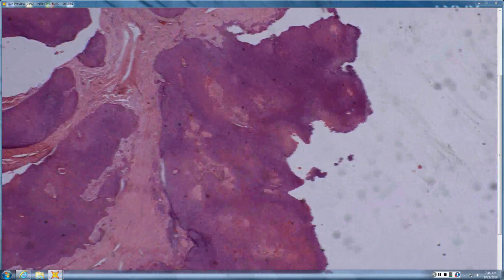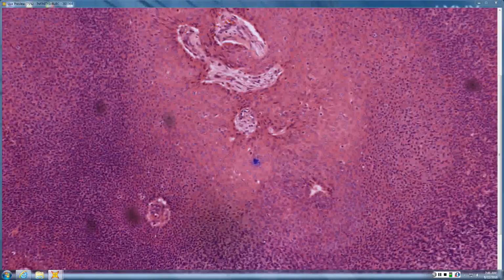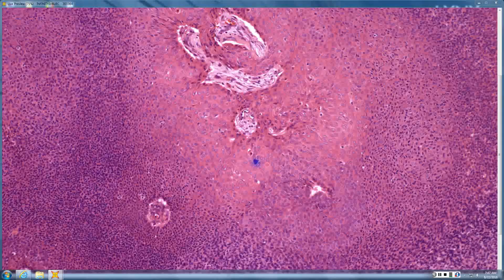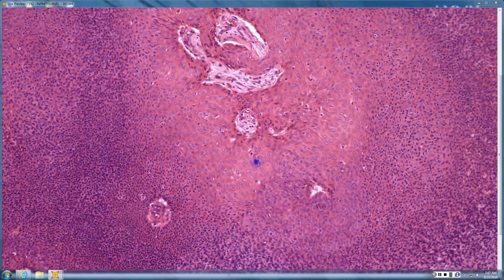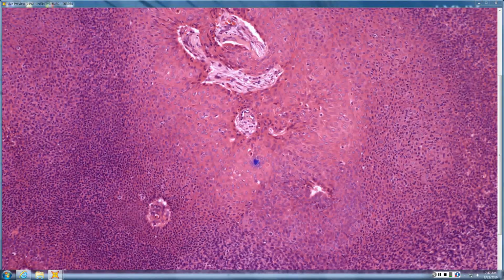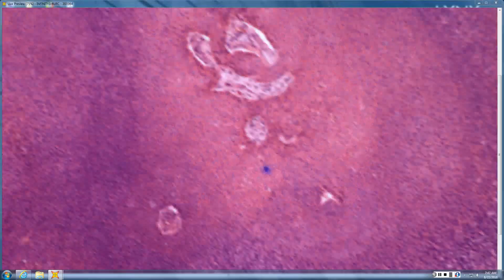Okay. So, Blake, what do you think? I want to say in the acrospiroma category. In the acrospiroma. So in this chapter, if you're pink with ducts, you're going to be an acrospiroma. And pretty much anywhere in dermpath, if you're pink with ducts, you're going to be an acrospiroma. If you're blue with ducts, if you remember from last week, you're going to be a sebaceous neoplasm. So blue with red circular ducts is going to be sebaceous tumor. Pink with ducts is going to be an acrospiroma group of neoplasm.